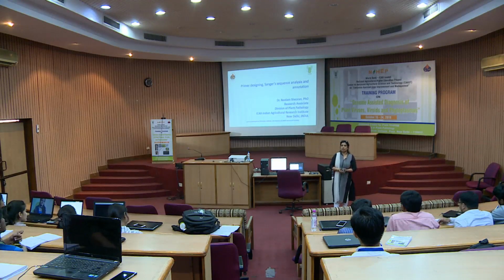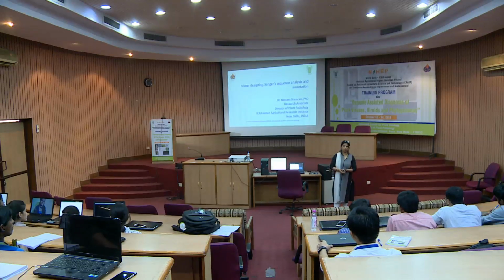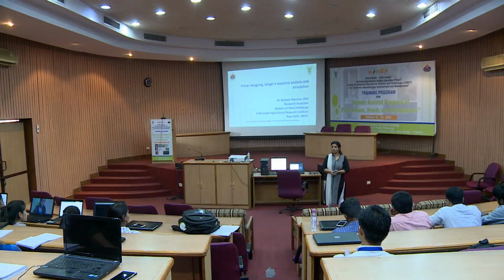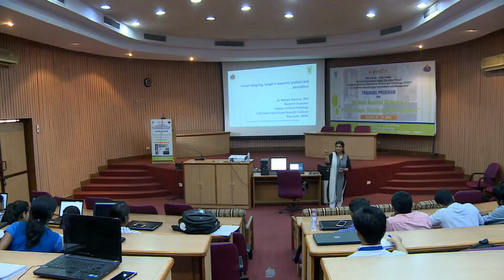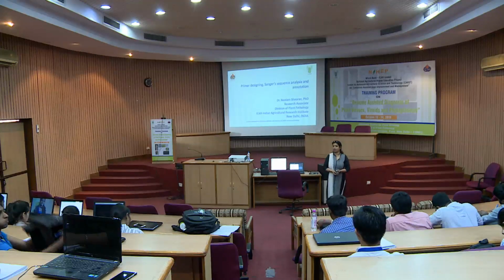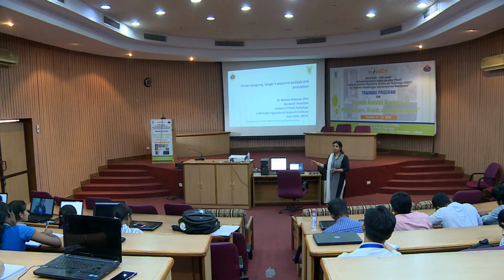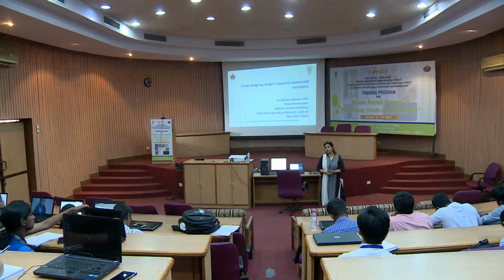Okay. So I'll be telling you a few software tools that are freely available online. You don't have to purchase them, and there is no licensed version. So you can use them at your end very easily. One is Primer 3 Plus. You please write it down somewhere, otherwise you will forget. So Primer 3 Plus is one of the software tools, but there are plenty of others, and I'll be demonstrating using this one.